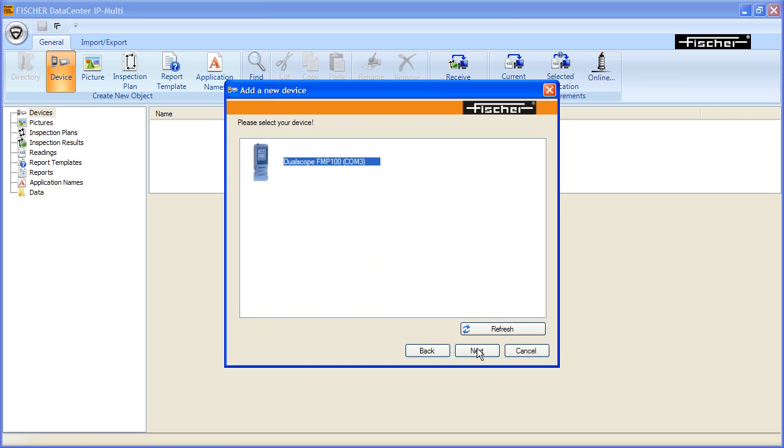From Select Device, choose your connected device and confirm your selection using the Next button.